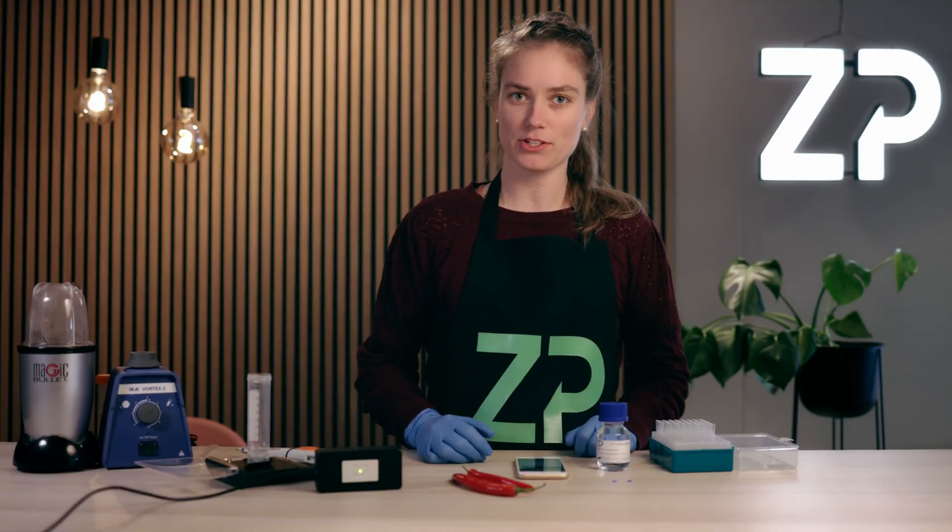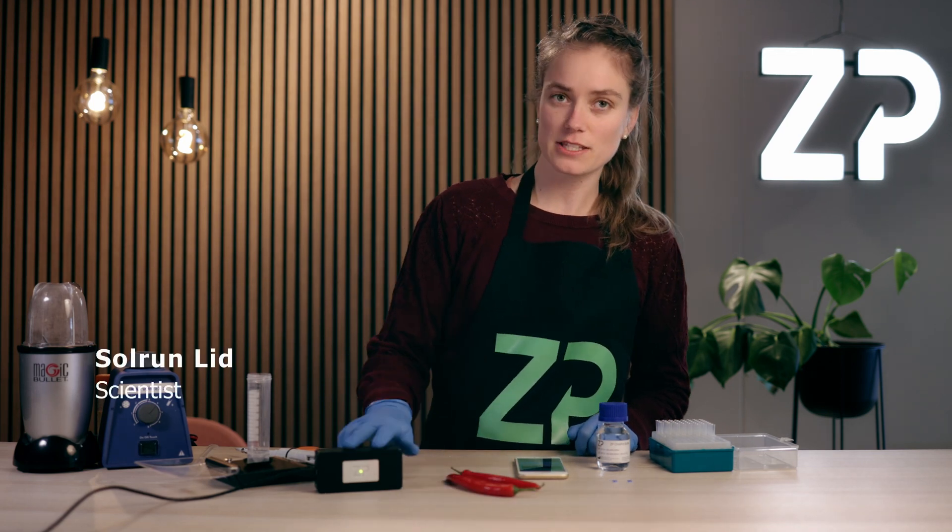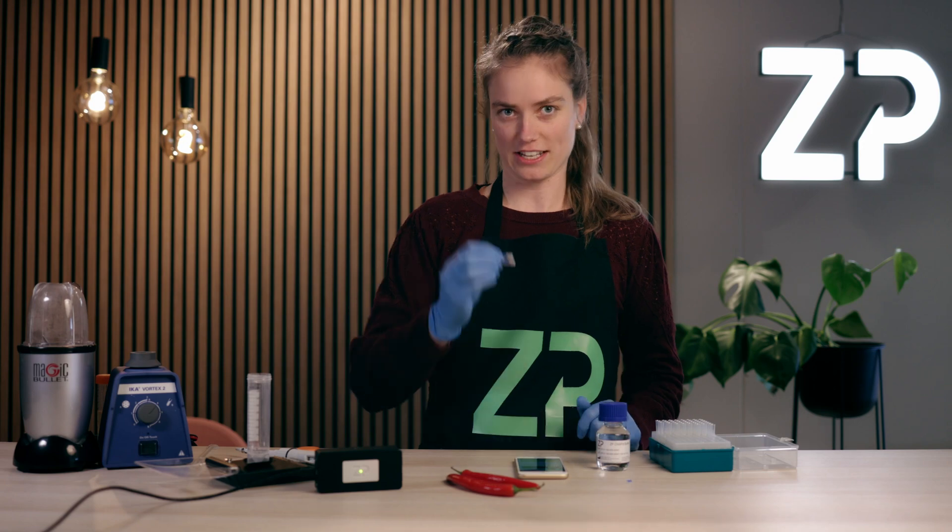Hey! Today I will demonstrate to you how to measure the spiciness of raw chilies using our FoodSense box and a chili sensor.